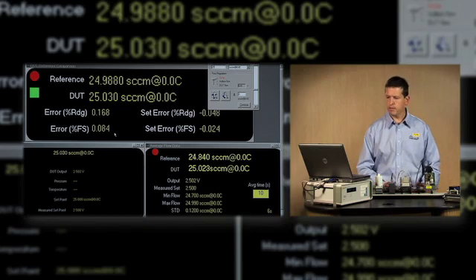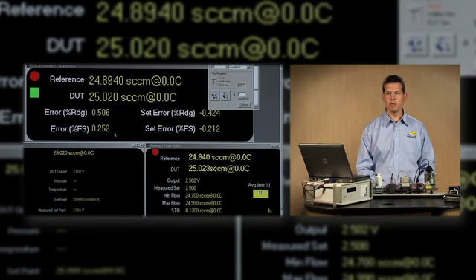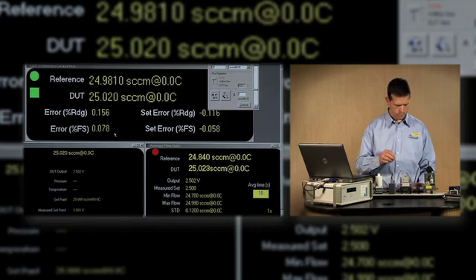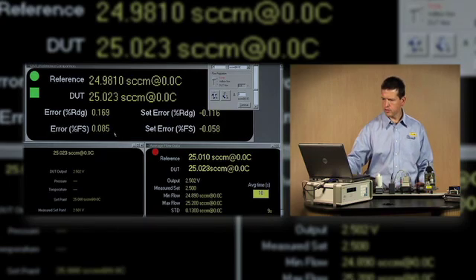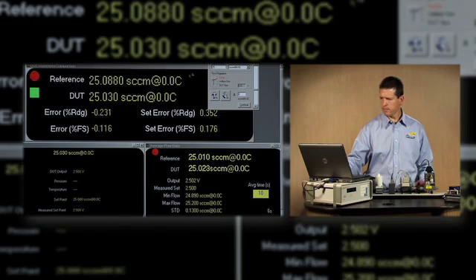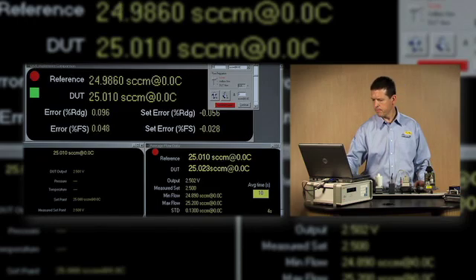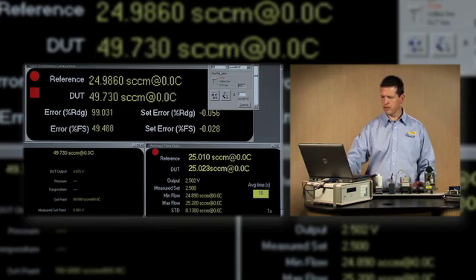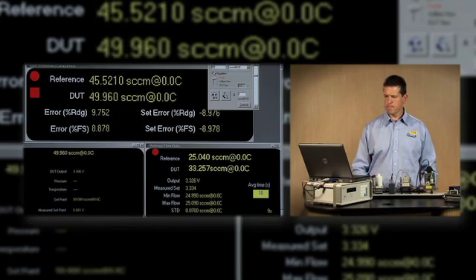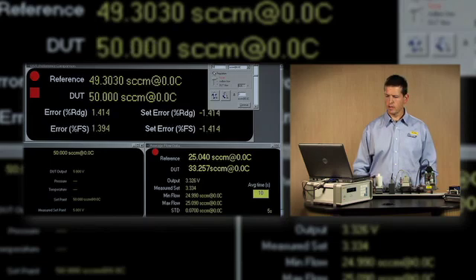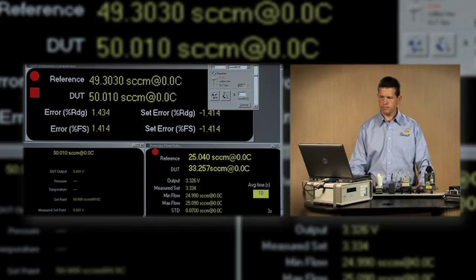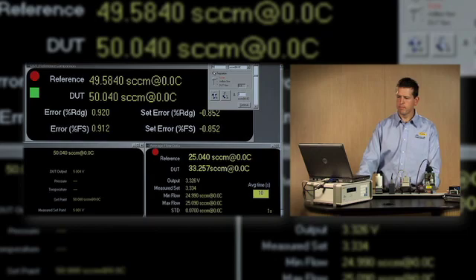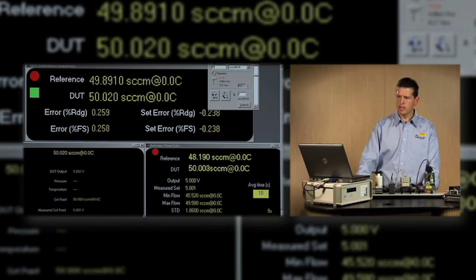Okay, that 50% adjustment will adjust the linearity of the MFC. Let me take another check up at the 100% point to be sure we're still in tolerance there. It looks like it's still pretty good.